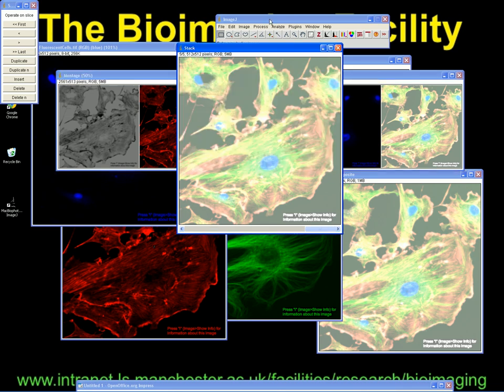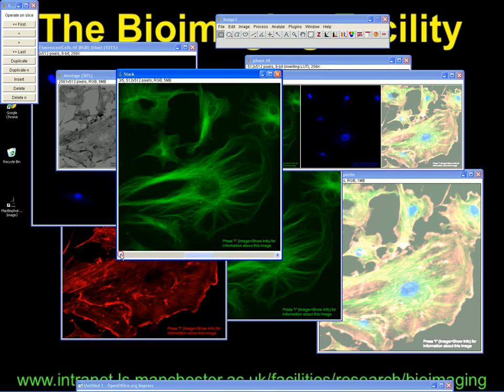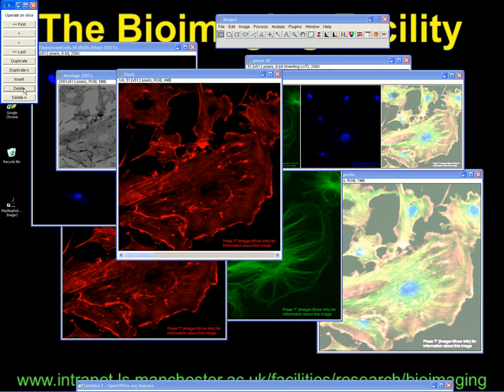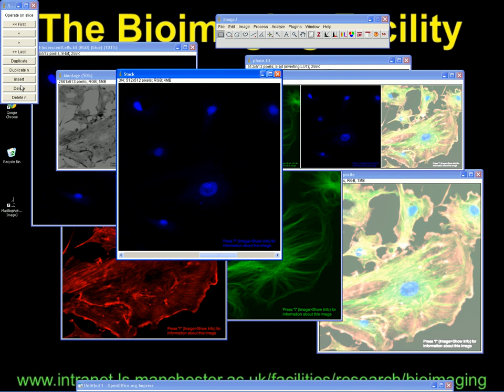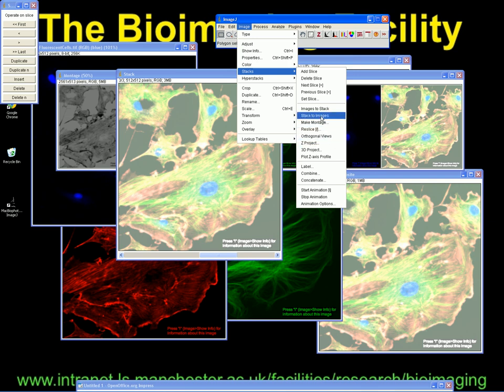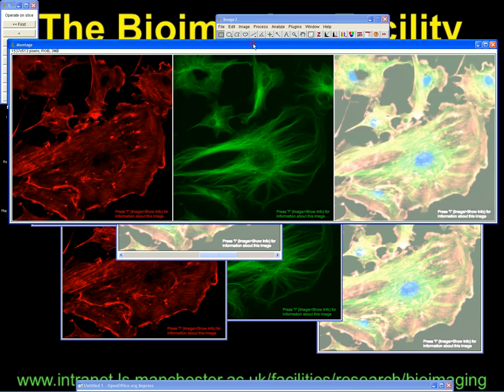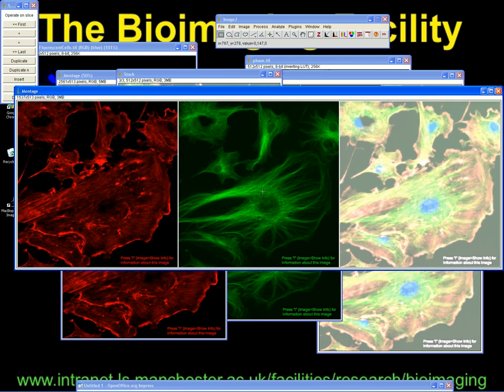The other way is to go back to your stack and get rid of some of these channels. Like we don't really care about the DAPI individually — we just want to show that in the merge. We don't really care about the phase as a standalone image at the beginning either. So you can go through and just delete the ones you don't want. Once we get rid of the phase and the DAPI, when we go to Image, Stacks, Make Montage, this time we only have three images. And that's the way it works — hopefully that's been some use.